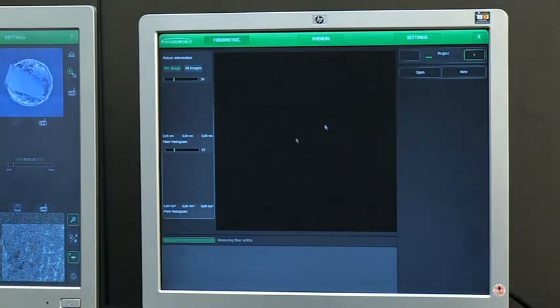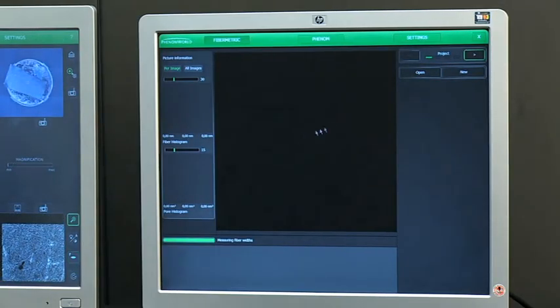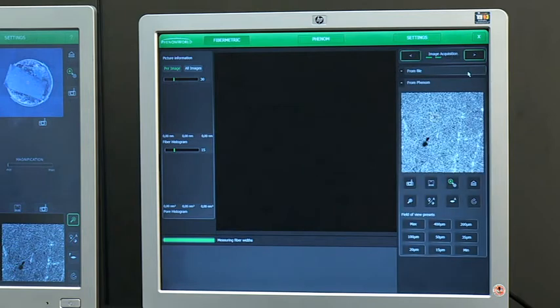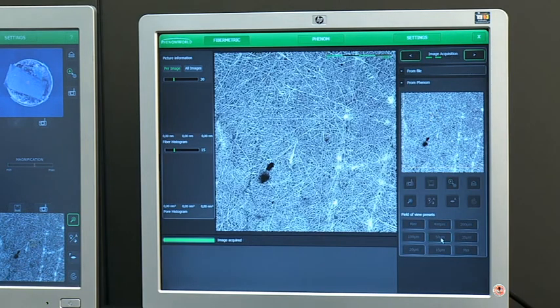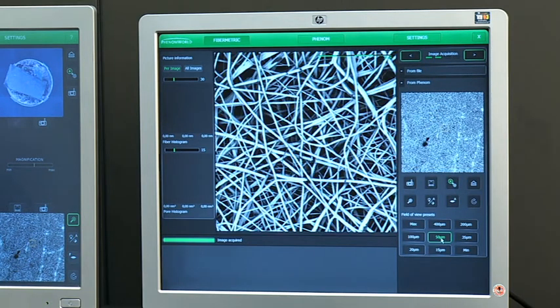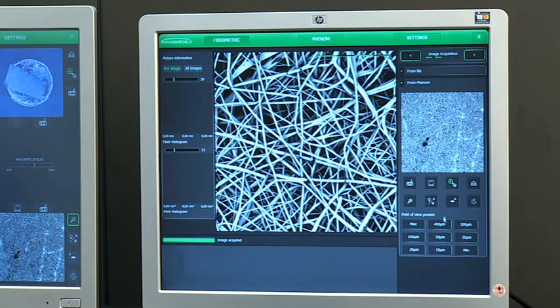The required field of view is selected from the preset menu below. The stage and sample can be controlled from the standard Phenom user interface or the FiberMetric application.